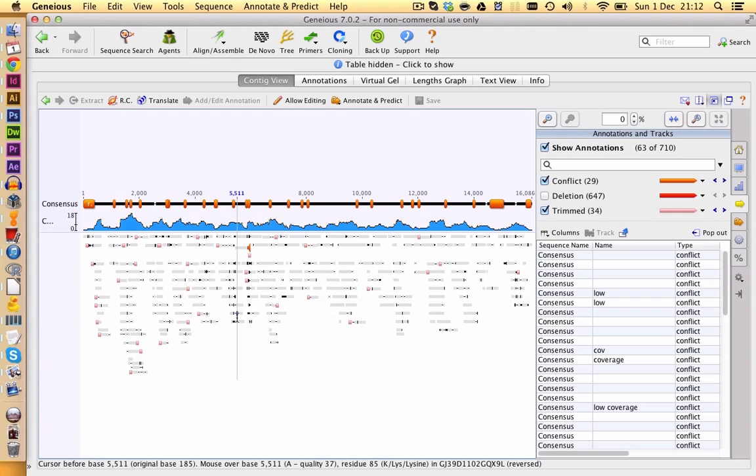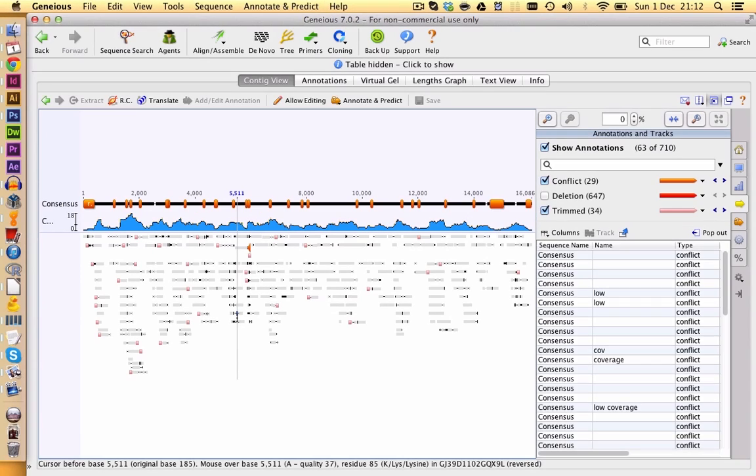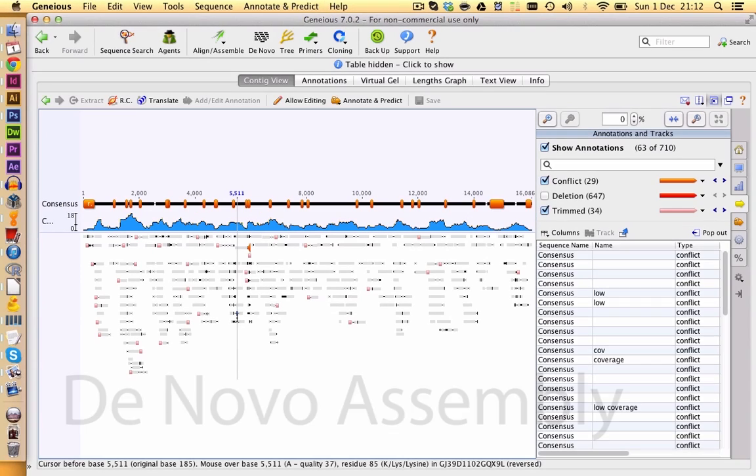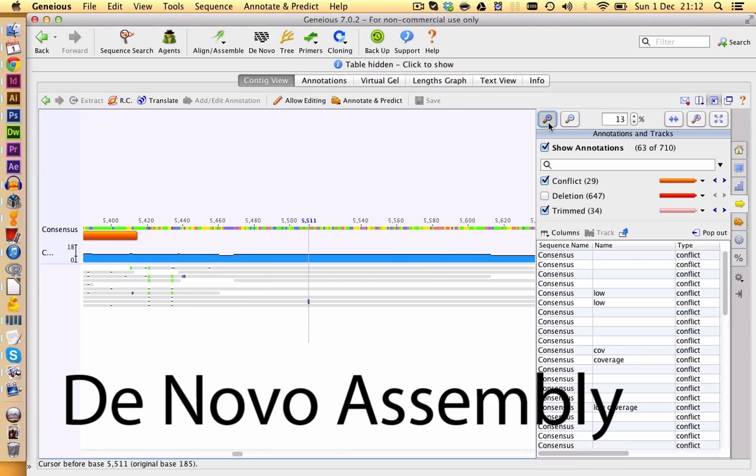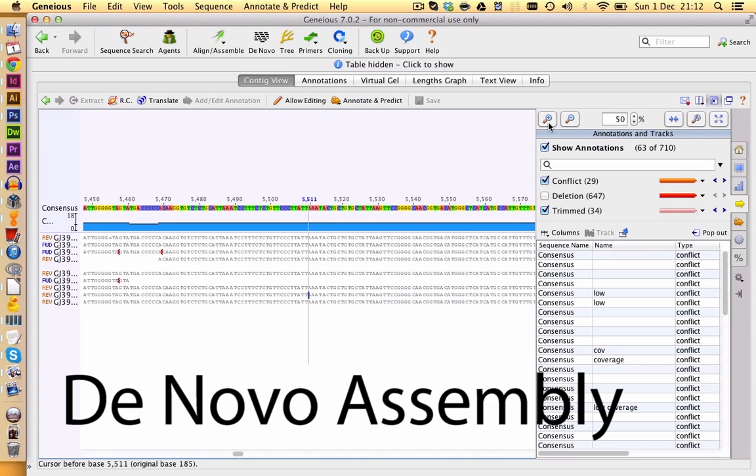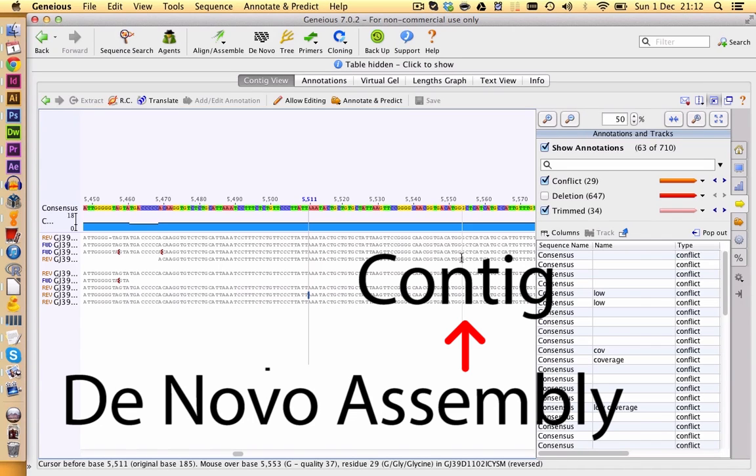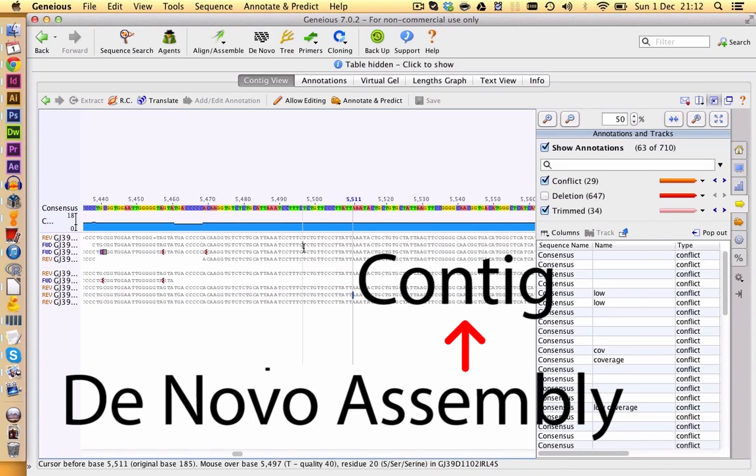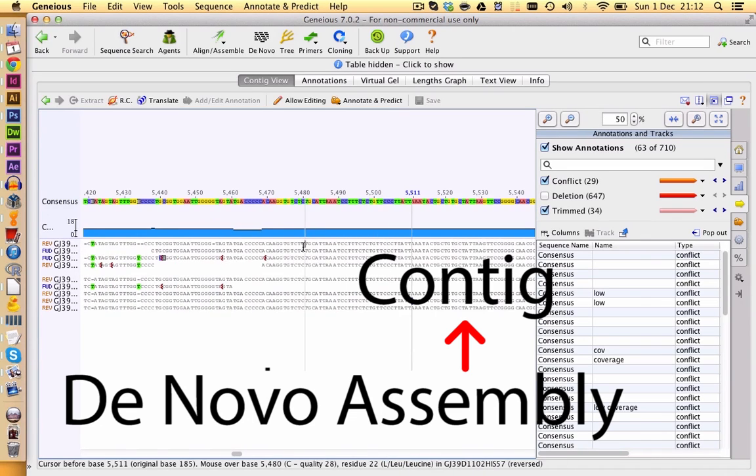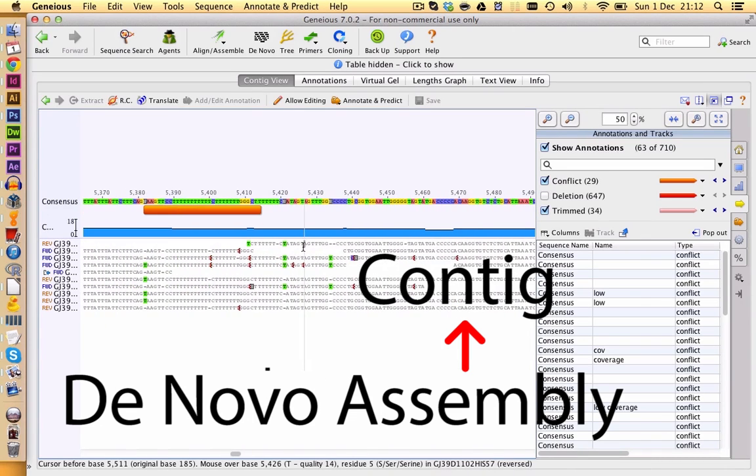When you do the same thing without a reference sequence, you talk about assembling your reads. Then Genius tries to figure out which reads fit together without having a reference sequence to map them against. The result of an assembly is called a contig. You see one of those contigs here.